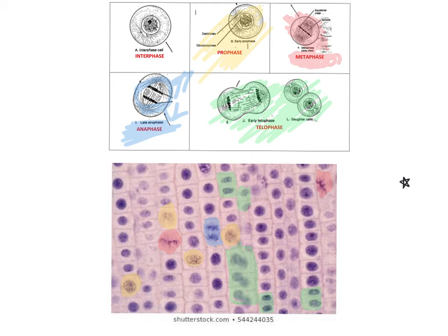And then lastly is interphase. Interphase is the longest phase of the cell cycle, so the majority of your cells will be in interphase. In interphase, the nucleus just looks like a round circle. So I'd say all of these are interphase. Interphase, interphase. These above where I'm coloring, I can't really identify. It looks like there's no nucleus, so I'm just going to leave them blank. I'm not coloring any that are cut off the side of the image.